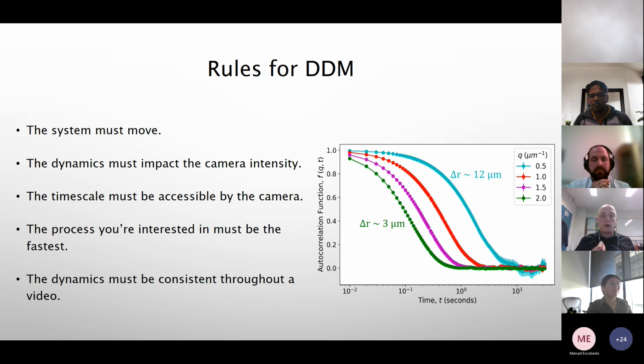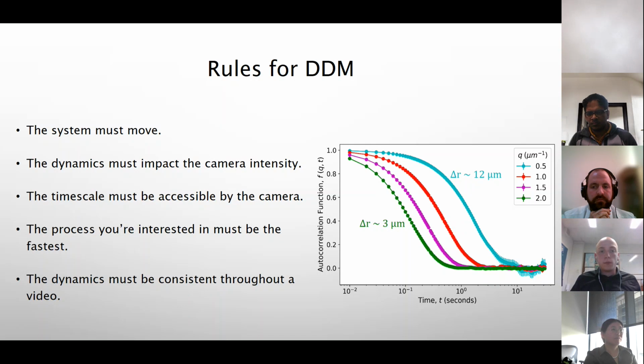As you get to smaller particles, you've got a very high diffusion coefficient. Say, for example, you're looking at 30 nanometer particles in water. At this point, you're already looking at very high diffusion coefficients, so you're already on the millisecond scale for a particle to diffuse a few pixels in the image or across very large distances. In other words, if your particle diffuses more than a few pixels between frames, you already lose the information that happens in that time. So your limit for lower particle size mostly comes from the limit on the frame rate.